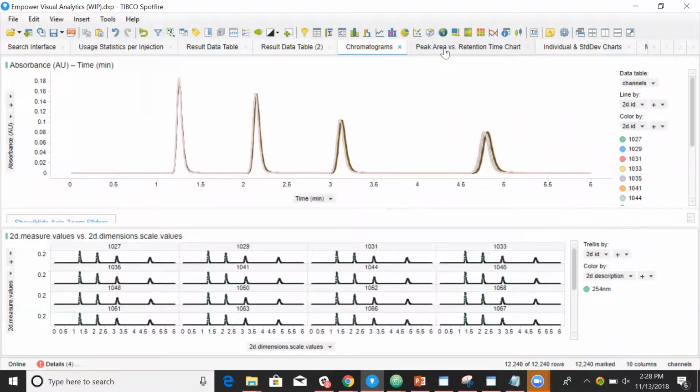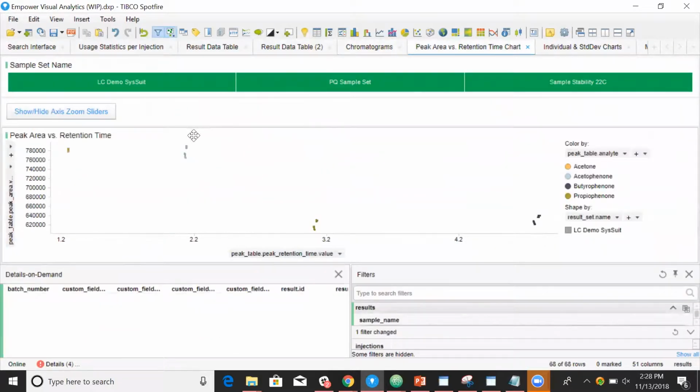We'll even be able to build some aggregate visualizations in order to perform more complex analysis and gain even more insights into our experiments. In this template, we can view the results table, where we can see an overlay of different chromatograms of our selected injections. Additionally, we can relate the chromatograms with different injection metadata.